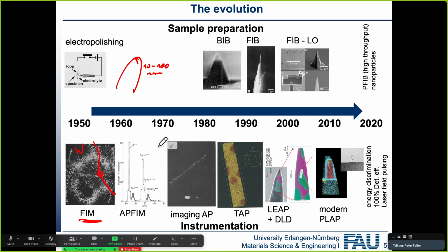What about the processing time of the detector? That doesn't actually matter, but we will see that later on, because the detector processes in sequence.